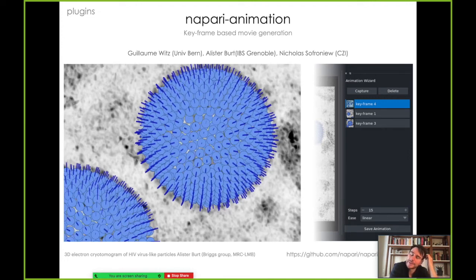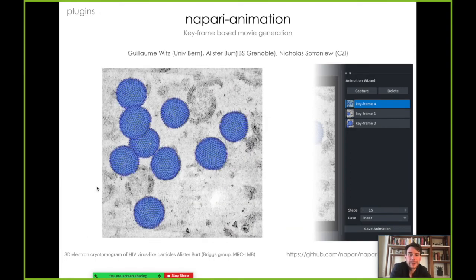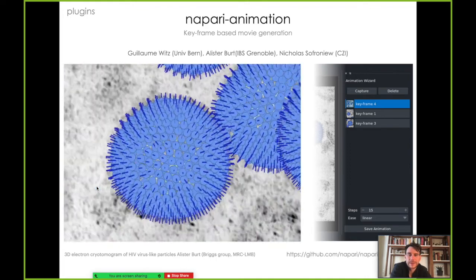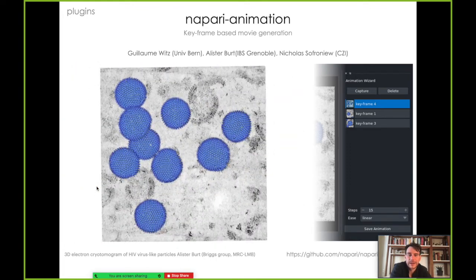Some of the nice plugins in the ecosystem right now: we've got Napari Animation, with great contributions from Alistair Burt and Guillaume Woods. This allows for making animations in Napari — you can select keyframes and it will interpolate the views between them. Really useful for making animations.